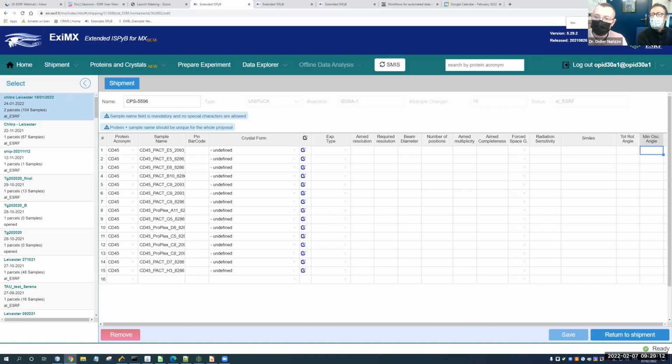And then Sanchari asks, what about photoreduction of metal centers? I presume you mean for the dose. You can control the dose to try and reduce photoreduction of metal centers. Is that what you meant? For the radiation sensitivity, if we have metal centers, how do we mention it? Again, you put that in this radiation sensitivity. Yes, so you push this up to a very high value.